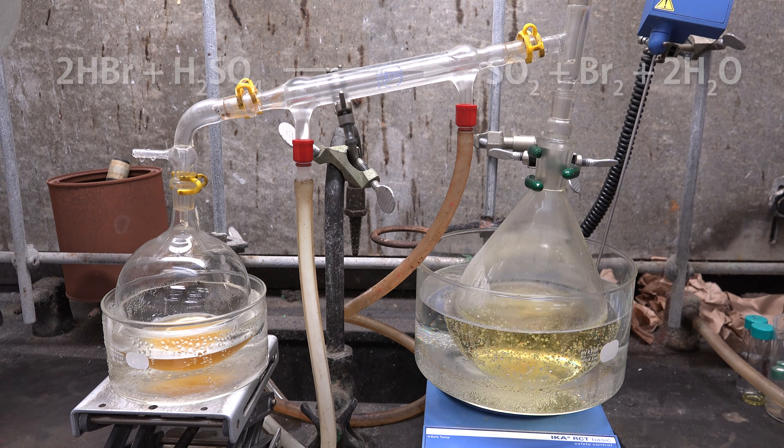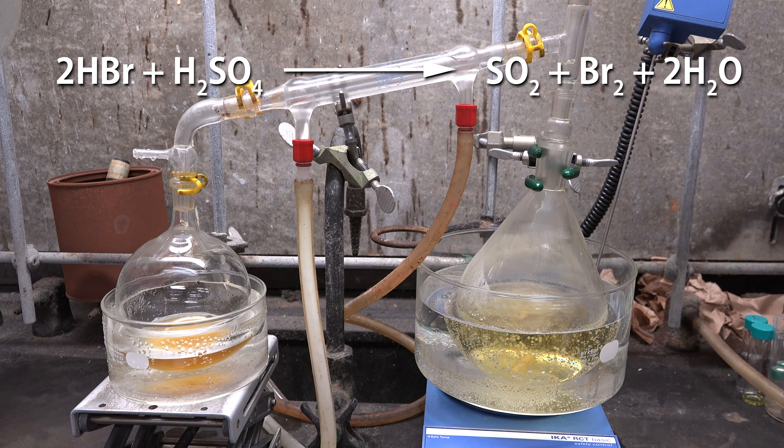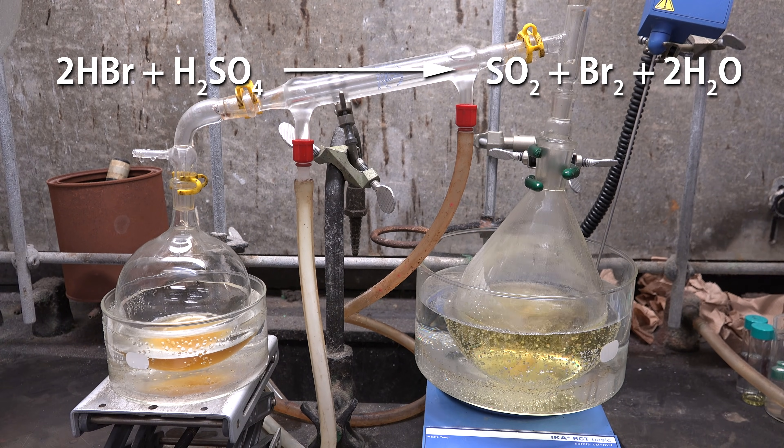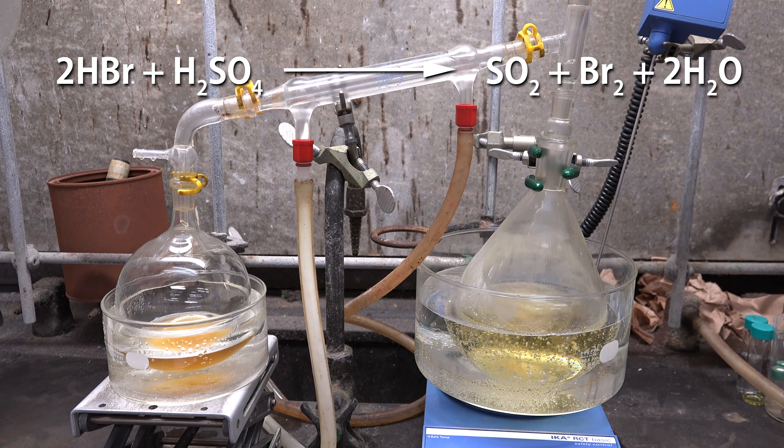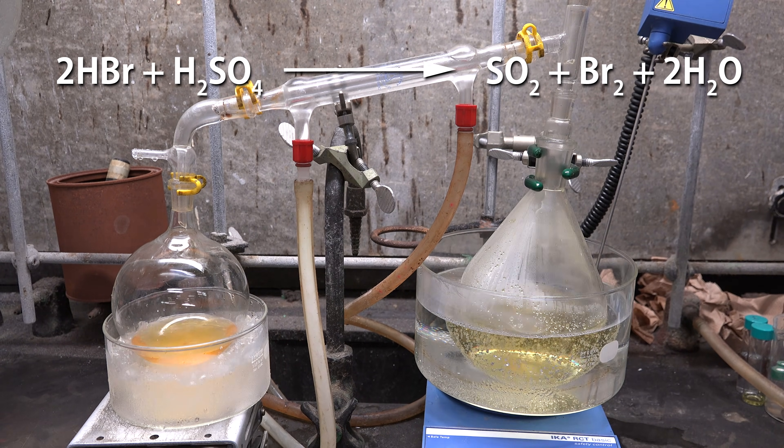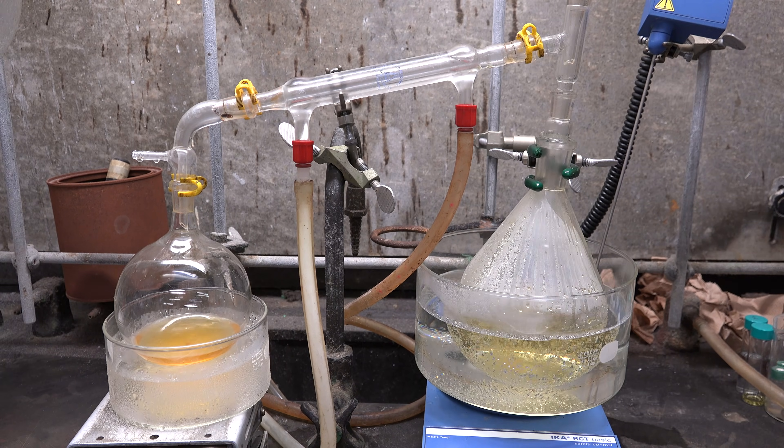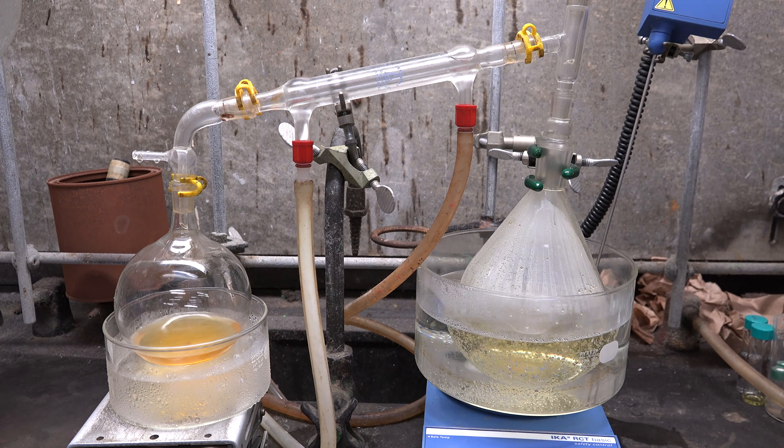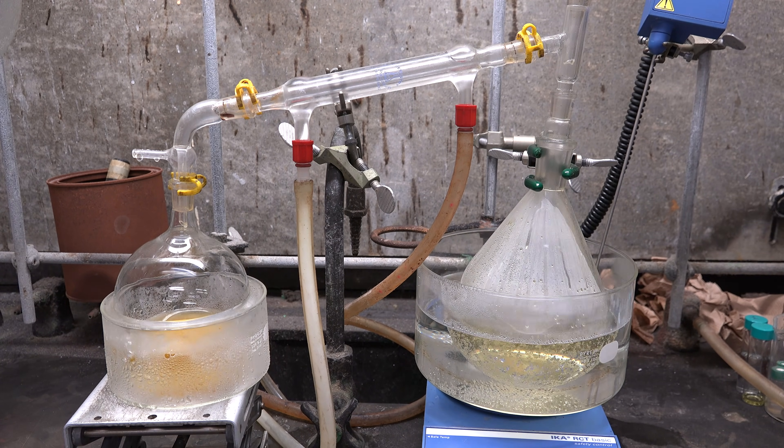Another side product is bromine itself. Hydrobromic acid reacts with sulfuric acid to create sulfur dioxide and small amounts of bromine. This explains the orange color of our distillate. Anyway keep running the distillation until nothing distills over when you reach a water bath temperature of 70 degrees celsius.